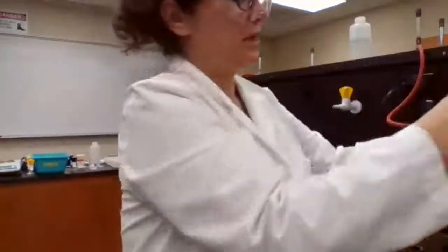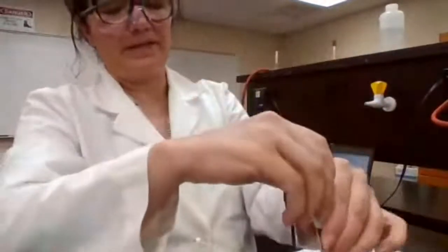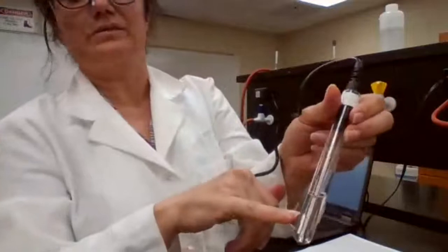Okay. So this solution, now everything has dissolved. And now I have to wait until I see the crystals, right? I have to wait and see the crystals in order to record the temperature.